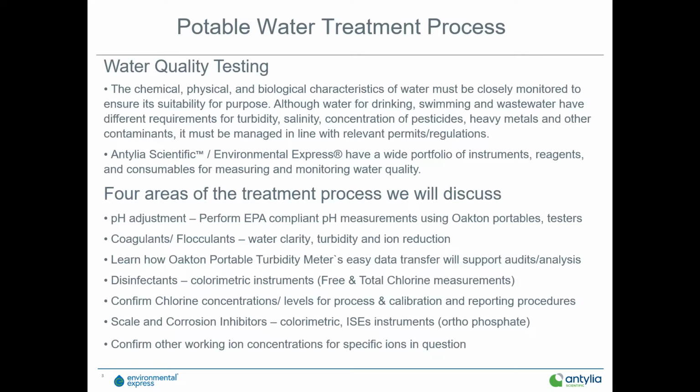Some of the areas I'd like to touch on today are pH adjustment, performing EPA compliant pH measurements using Oakton portables, flocculants and coagulants, and tying that to water clarity, turbidity, and ion reduction, and how to use the new Oakton portable turbidity meters with easy data transfer to support an audit or analysis.